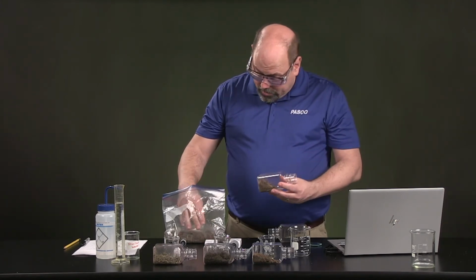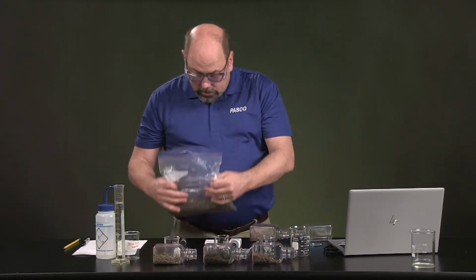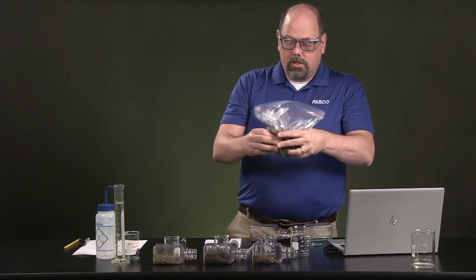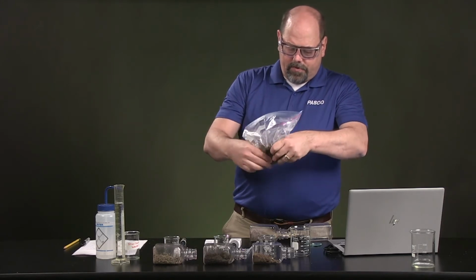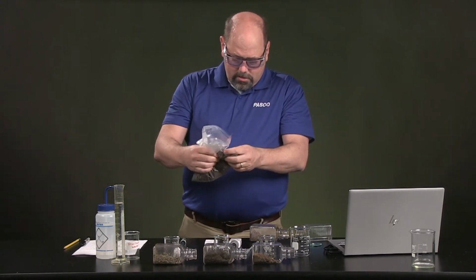So first of all, you want to make sure that the soil has gotten broken down into small enough particles. You can either take it in the bag, if you're doing this yourself, and break those clumps up. That's a good method. If you've got a pestle, you could do that in a pestle as well, so it'd be nice and fine. But I think small particles are going to be just fine.